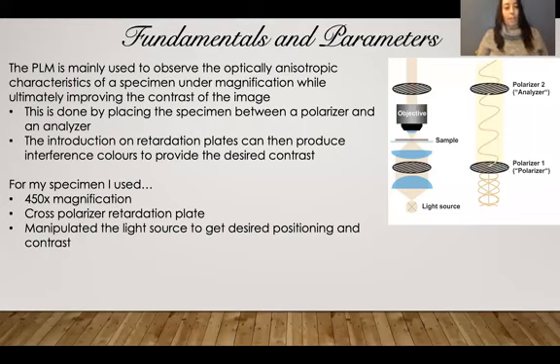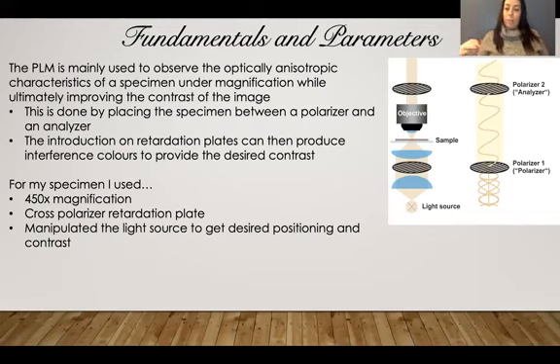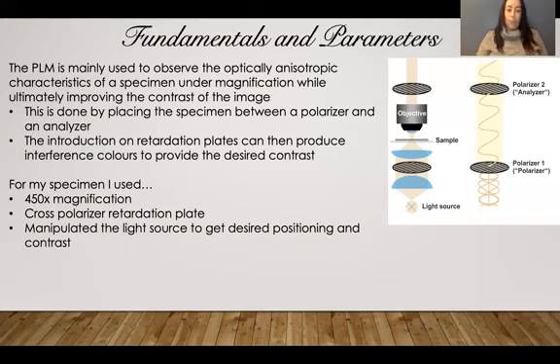Fundamentals and parameters: as we've learned in class, the PLM is mainly used to observe the optically anisotropic characteristics of a specimen under magnification while ultimately improving the contrast of the image. You have your sample, a polarizer, and an analyzer. The polarizer sits between the light source and the sample while the analyzer sits between the optical pathway and the sample. Introducing retardation plates can produce interference of colors to provide that desired contrast. For my specimen, I used 450 times magnification and added a cross polarizer retardation plate because it showed a lot more of the contrast I wanted.